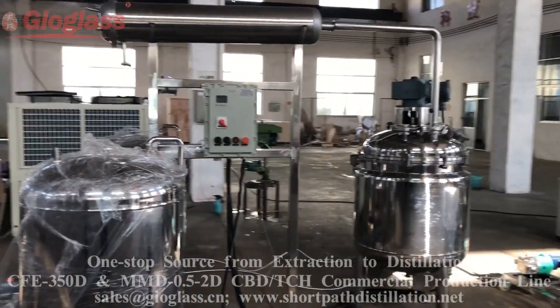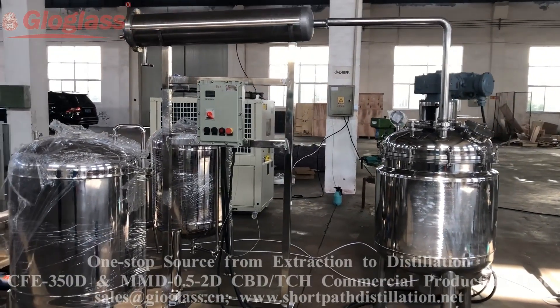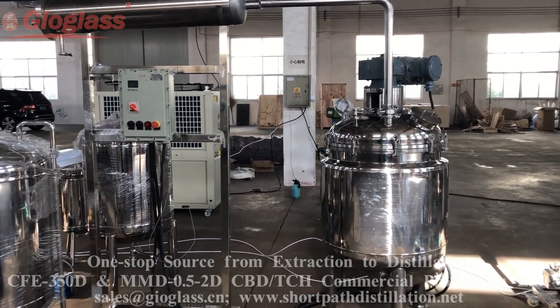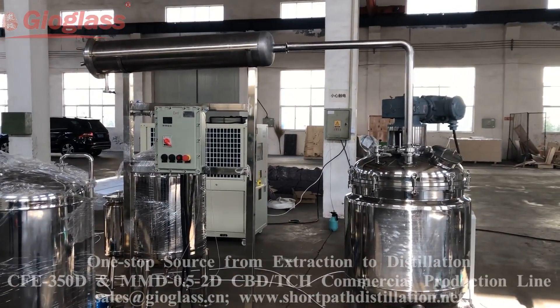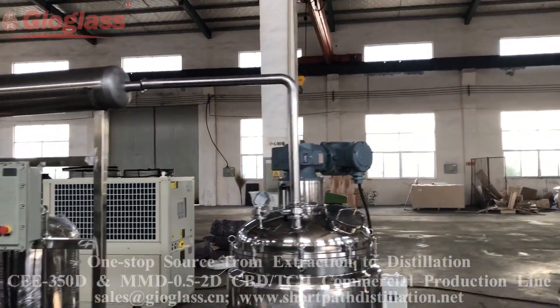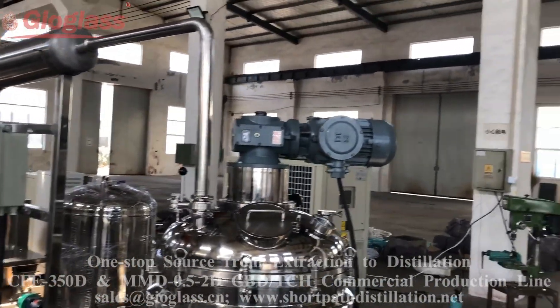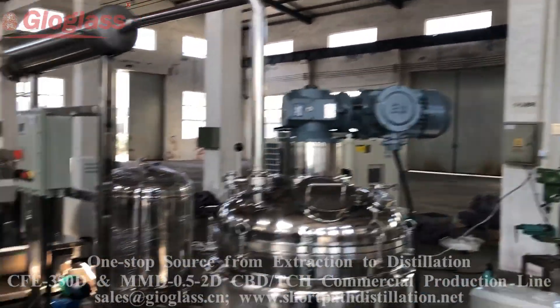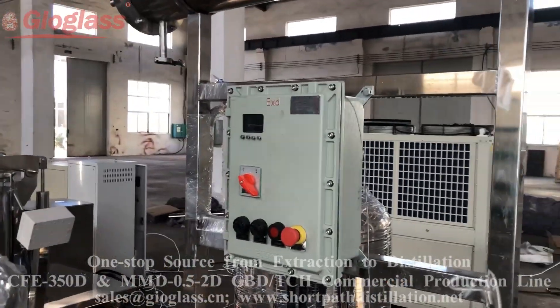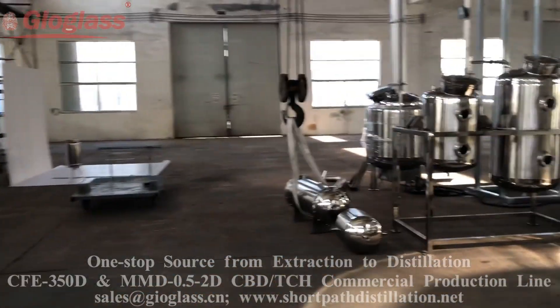The flash evaporation reactor is used to do the ethanol recycle process. This is also an explosion-proof design, with this control cabinet.